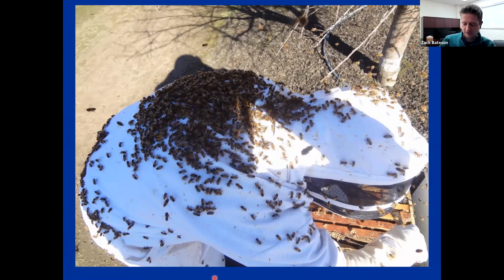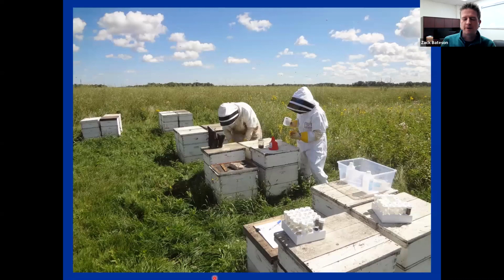I thought this was an interesting picture. They're all over my colleague here. And then just another picture. What's happening right here is my lab manager, Megan O'Neill, is sampling the bees for varroa mites. We do an alcohol wash for that. Those bees that are euthanized are actually the same bees we use for our pathogen testing.